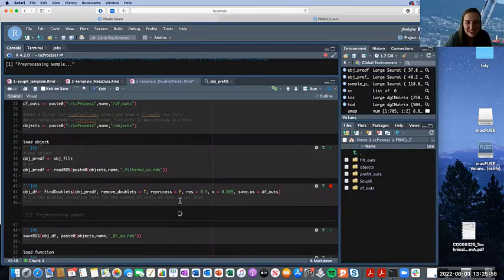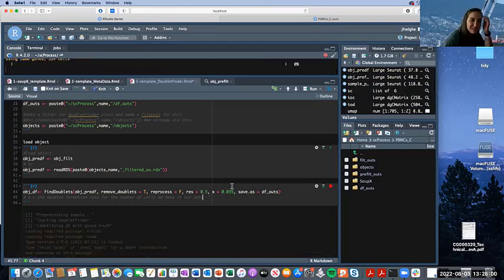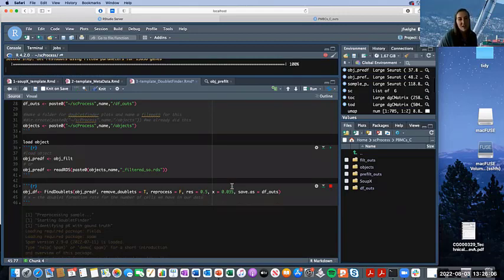And then feel free to correct any of my concussed brain typos that you see in these scripts. There's a big disclaimer with that. So this is actually going to take a little bit of time to run. The larger the data set, the longer it's going to take, just so you know. So we're going to let that go.